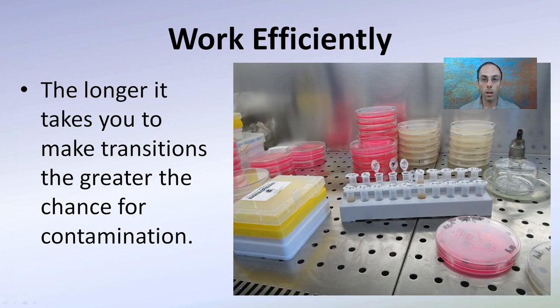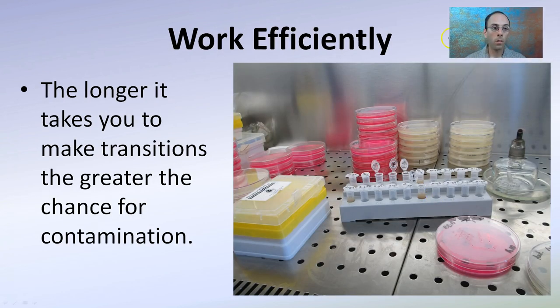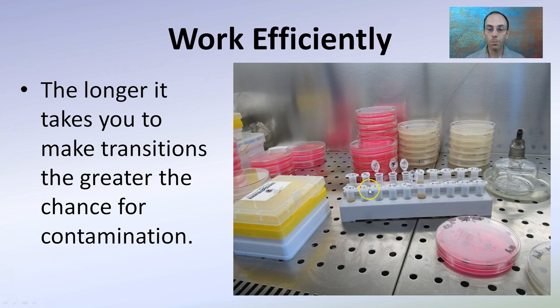You want to work efficiently. The longer it takes you to make transitions, the greater the chance for contamination. Here we see we're in a sterile hood — everything is close, everything is efficient. The plates are here, all the tubes are here, we've got a flame. Everything is in very close quarters, easy to find, easy to get to. Through proper lab technique, you should be able to work through this efficiently.